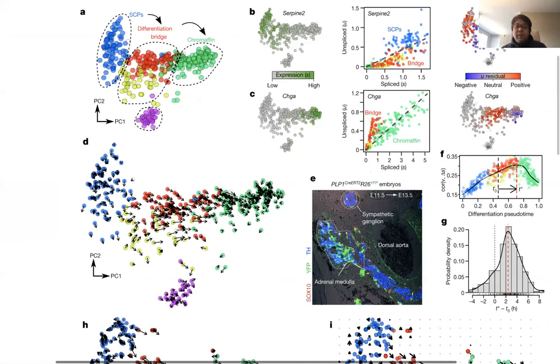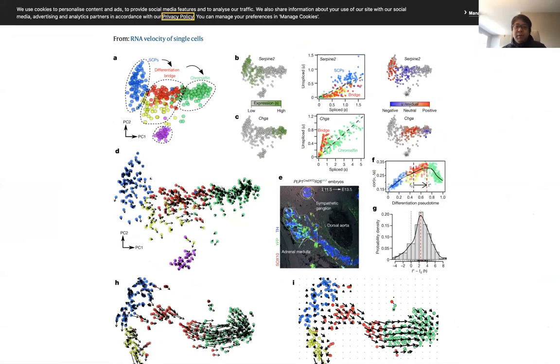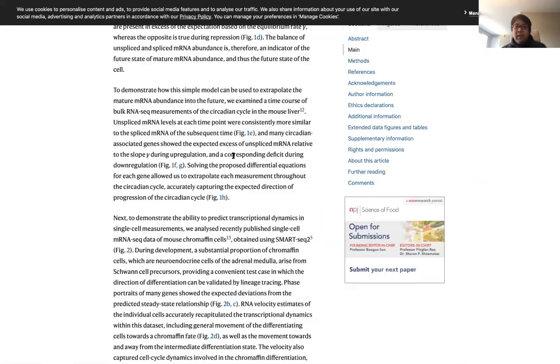But please imagine that we have a lot of dropout or noisy counts. Then our comparison or our model is going to be really bad. So we need to do imputation in the first part in order to get a better result.